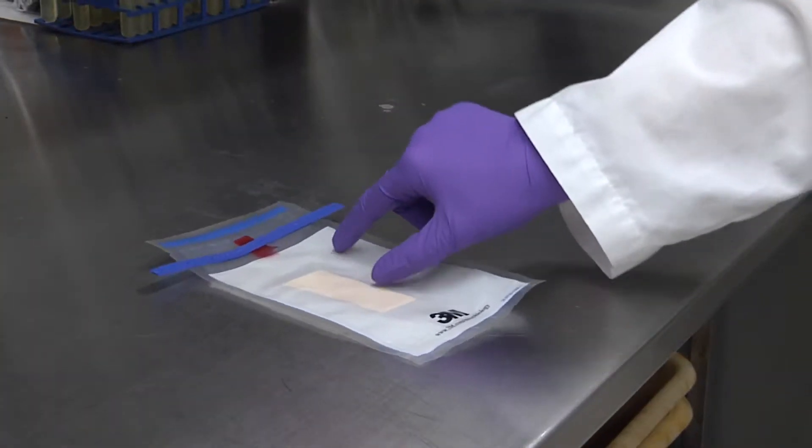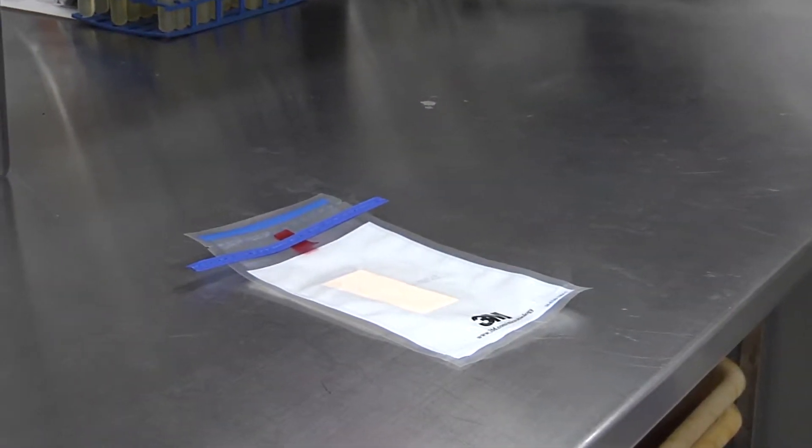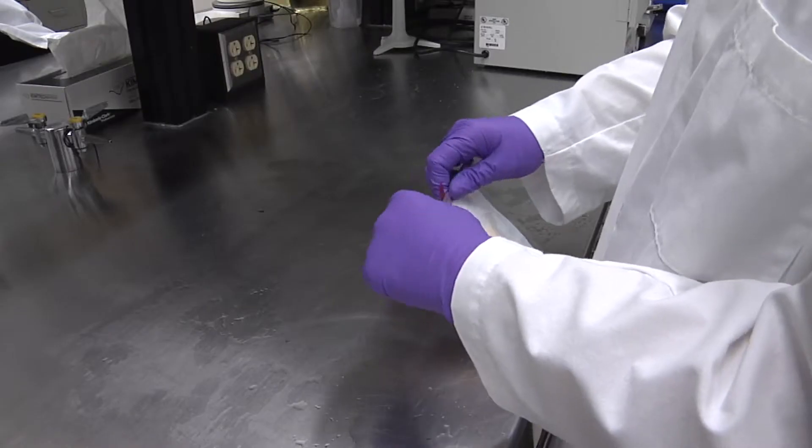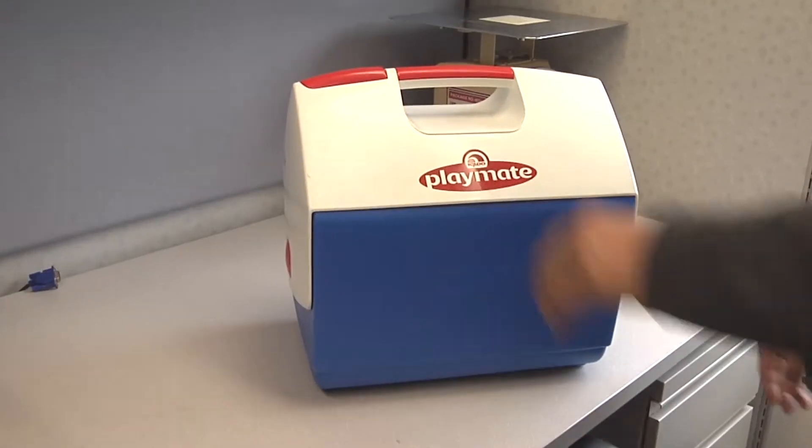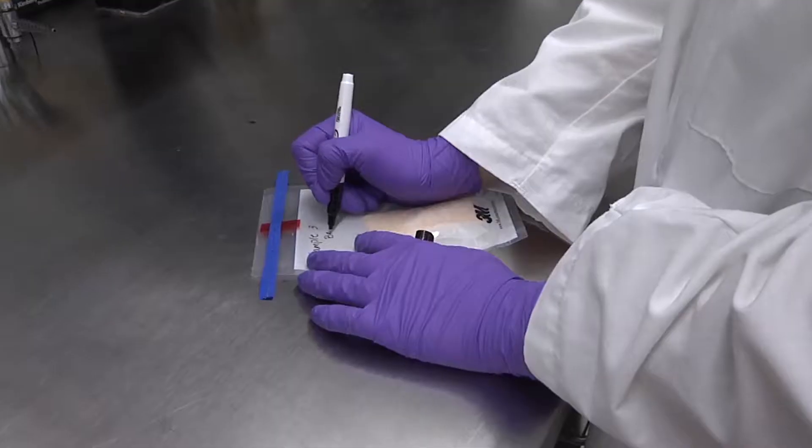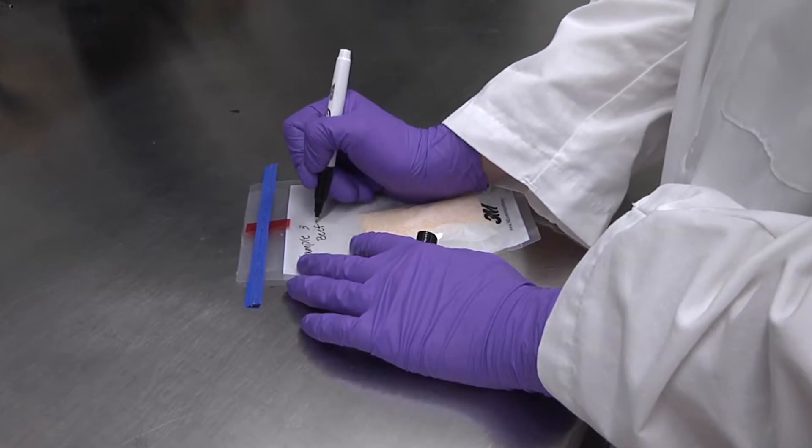For sponge testing, you will need a sterile, pre-moistened sponge, a pair of sterile gloves, and a cooler for transport. A marker is also needed for marking the sponge bags.